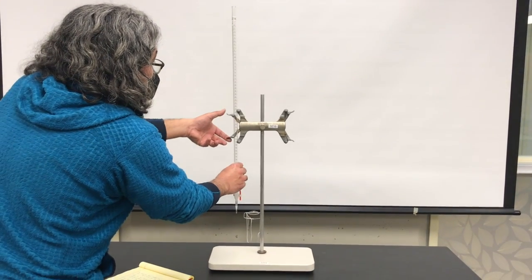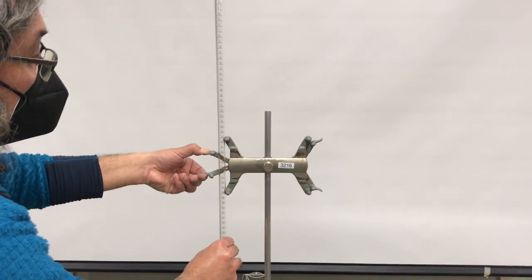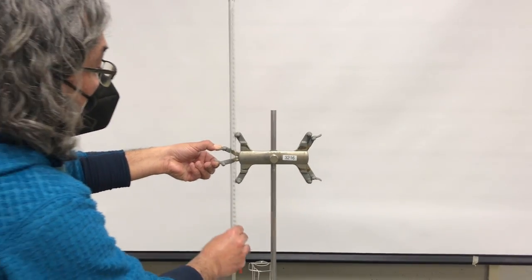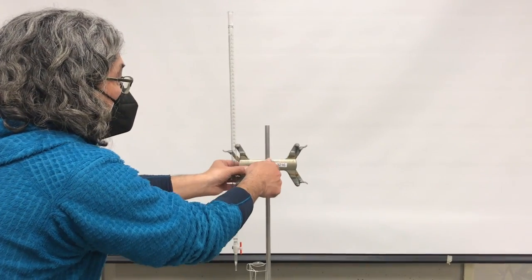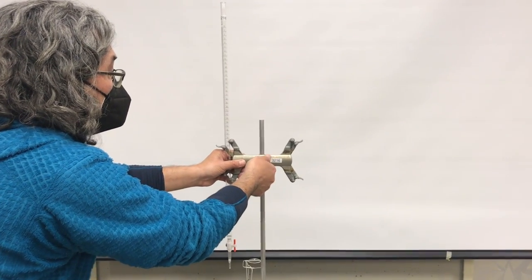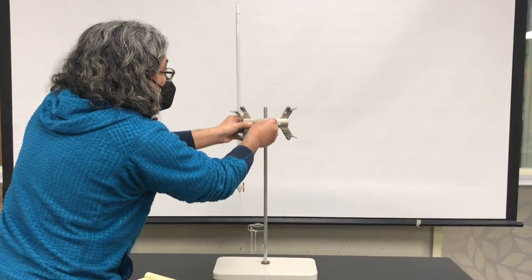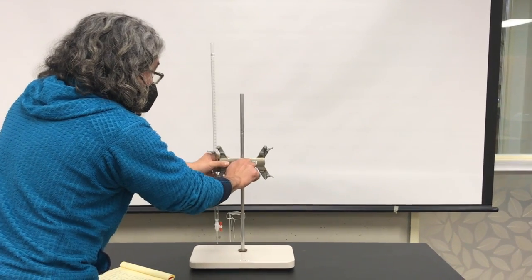You can adjust the burette on the clamp by pressing on the springs so that the burette is loose, and then you can move it up and down. And then you can also loosen the set screw for the burette clamp and move the clamp up or move the clamp down.